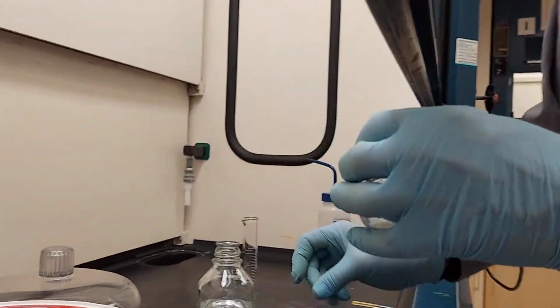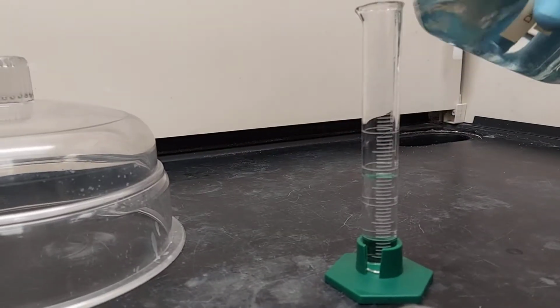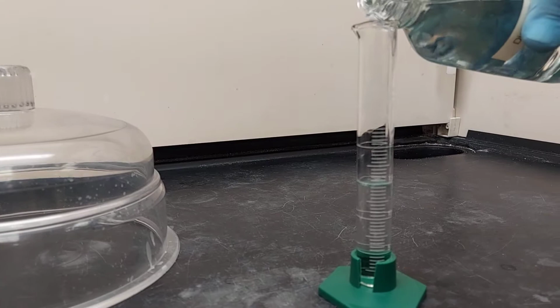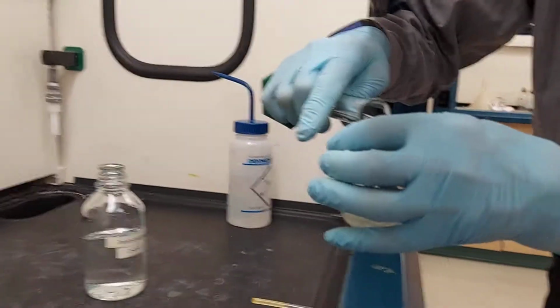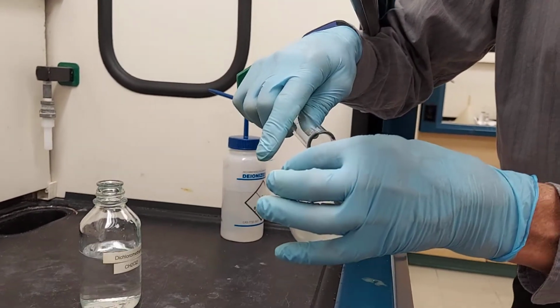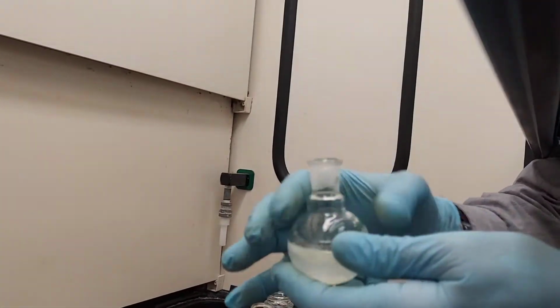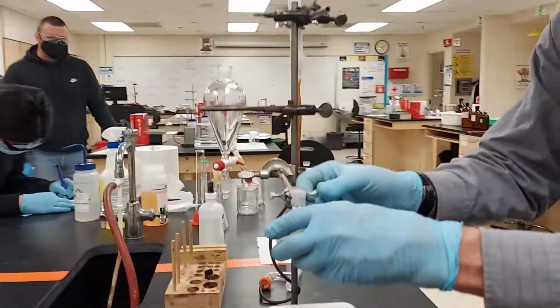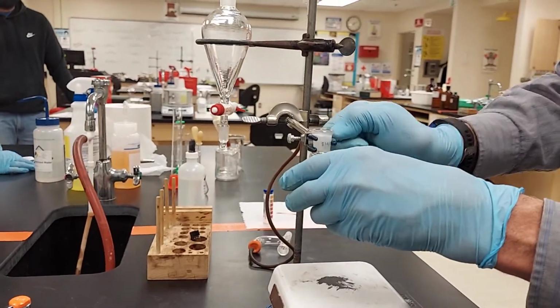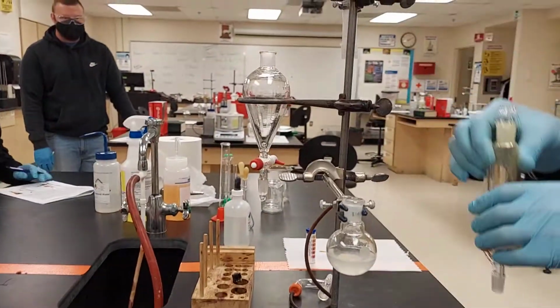You got it. Now how much dichloromethane this time? 15 ml. And go a little over to compensate for going a little under last time. And this solution is not a solution. It's a heterogeneous mixture with some cream-colored aluminum chloride that does not dissolve. And while we get this set up here, I want to seal it because moisture is our enemy today. We're going to make sure it stays dry.